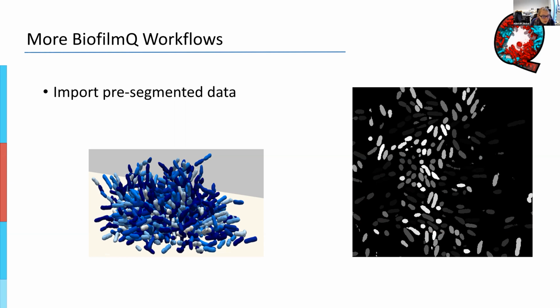The idea is, and Niklas explained this very nicely before, BiofilmQ is not a state-of-the-art segmentation software, not at all. We only provide some very basic thresholding. We provide some very basic classical image analysis. And the reason why we do this is that we are not a lab that develops image analysis segmentation tools, basically. So we do not really develop advanced watershed algorithms. We have some things that we apply to our data, but we know that there are other groups out there which are much better.